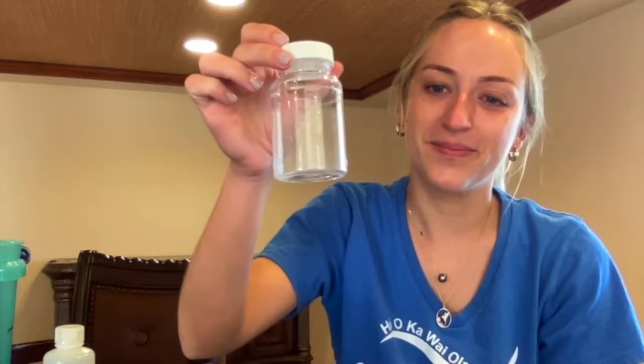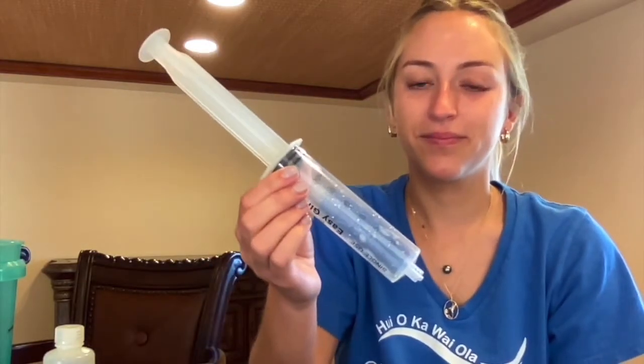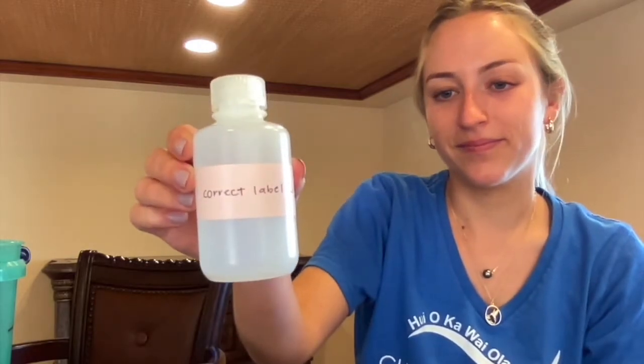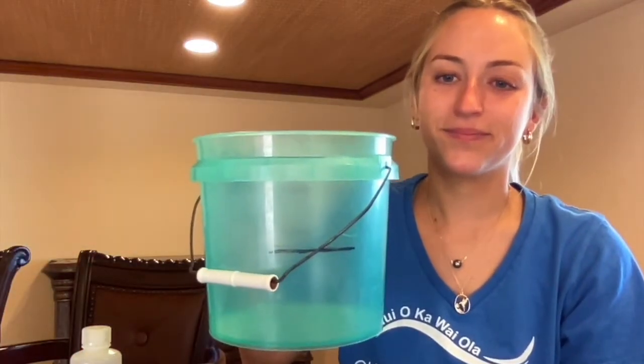Here is what the turbidity sample bottle looks like. Note that there is no label on the turbidity sample bottle. Here's the nutrient syringe. The nutrient sample will be collected with the syringe and filtered into the nutrient bottle, which is labeled with the sample ID. Make sure that the nutrient bottle is not used to collect an actual sample in the ocean. Here's the bucket to collect water for reading pH, salinity, and DO.